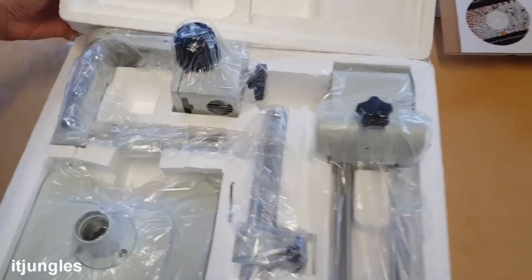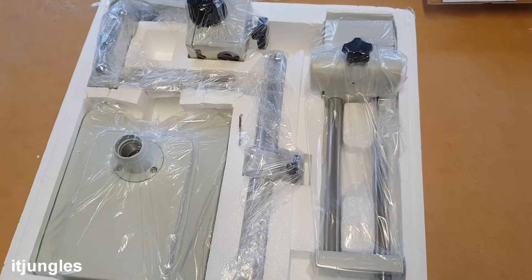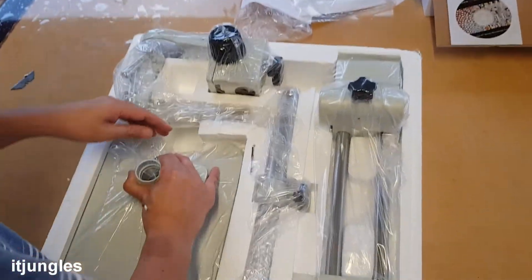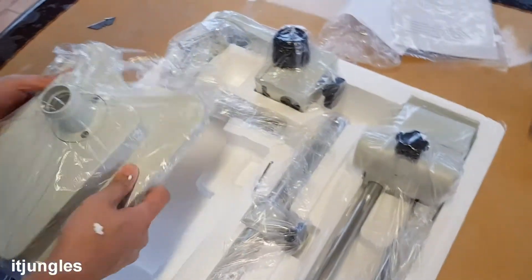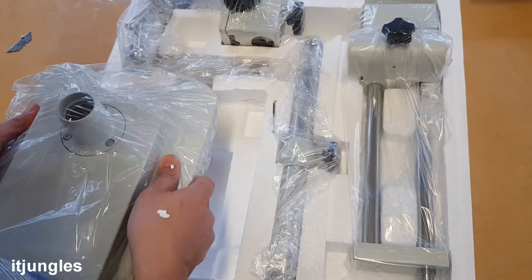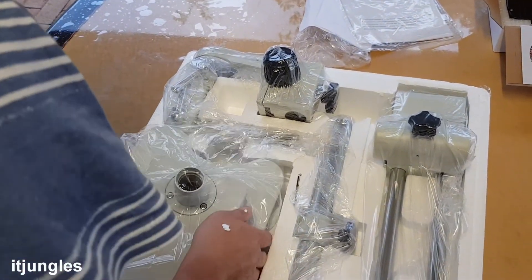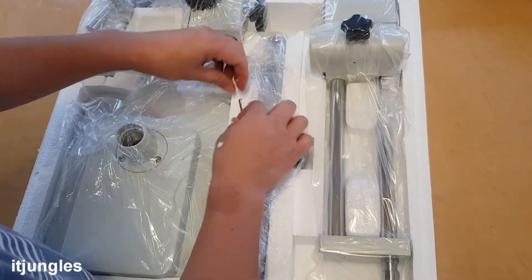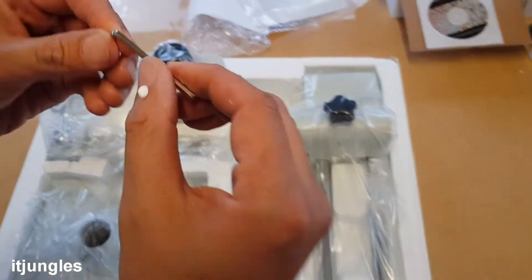So that is the rest of the machine right there. Those are the legs of the stand. This piece here — you can easily weigh around 20 kilos. It is really, really heavy. So I'll just leave it in here so you can actually see it. There is also an Allen key that comes with it, though it's a bit rusted.